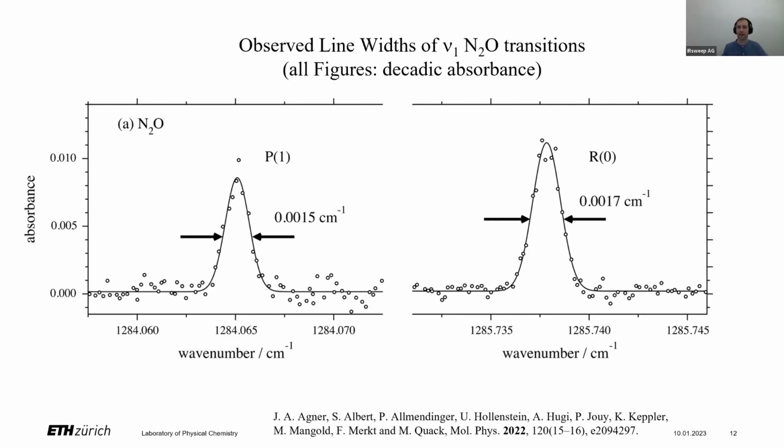Do you remember the integration time for this measurement? That's probably 100 microseconds or a few hundred microsecond integration. I would guess 100, because it was a 2 to 3 microsecond, I think.